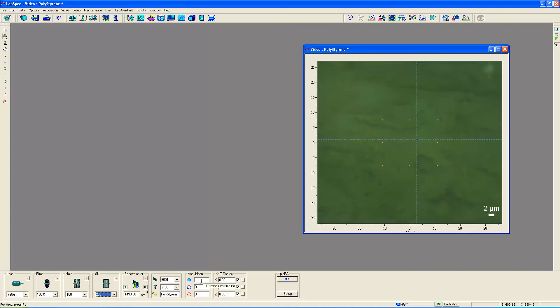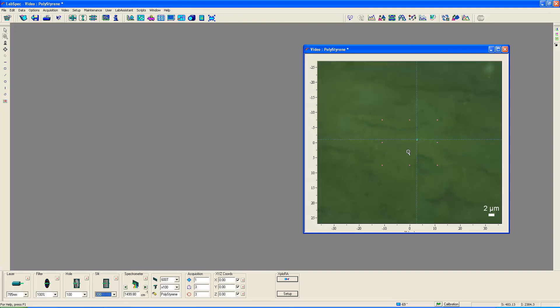Our real time acquisition is one second, and when we do acquire a spectrum, it'll be a three second integration time for a total of three accumulations, which is to say a total integration time of nine seconds. I've set the coordinates all to zero for our current position, and this is what we see in reflected light from our current position.